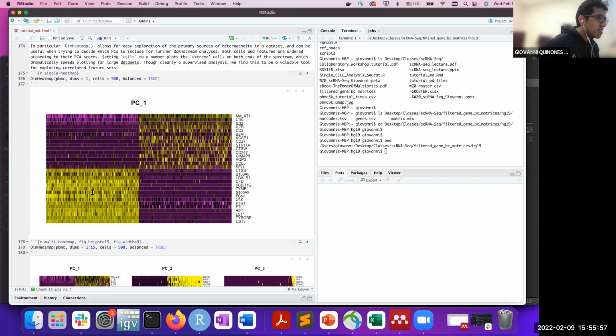I believe yellow could be a very high PC value and purple very low, or the other way around. But what this shows is that we can now very clearly cluster different genes based on this new coordinate system. It looks like very clear-cut clustering: these cells have a very similar expression pattern, and these cells have a different expression pattern.